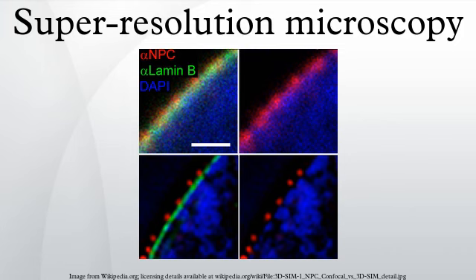Software for localization microscopy. Localization microscopy depends heavily on software that can precisely fit the point spread function to millions of images of active fluorophores within a few minutes. Since the classical analysis methods and software suites used in natural sciences are too slow to computationally solve these problems, often taking hours of computation for processing data measured in minutes, specialized software programs have been developed. Once molecule positions have been determined, the locations need to be displayed and several algorithms for display have been developed.